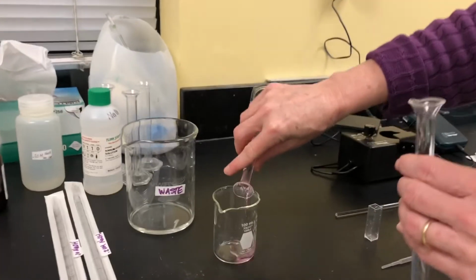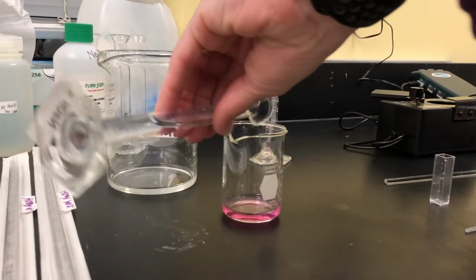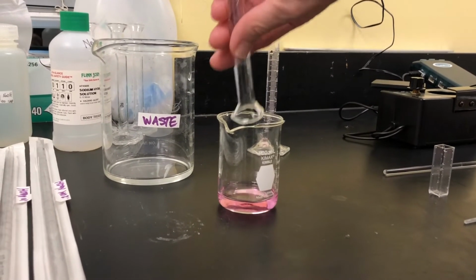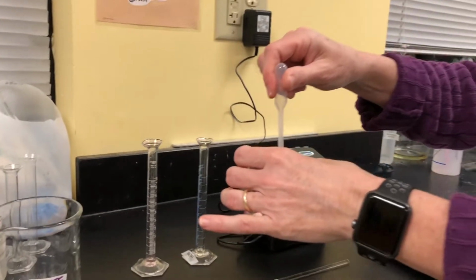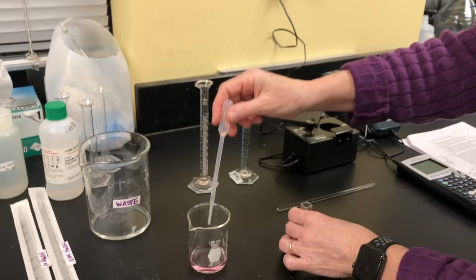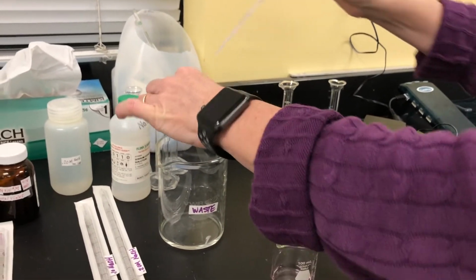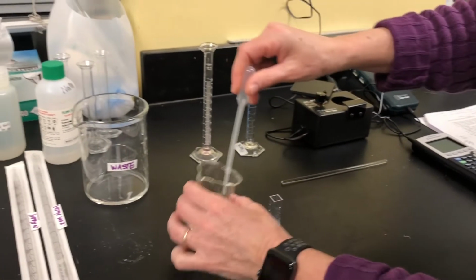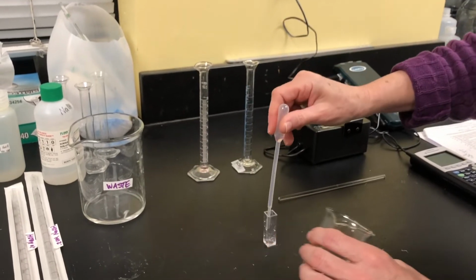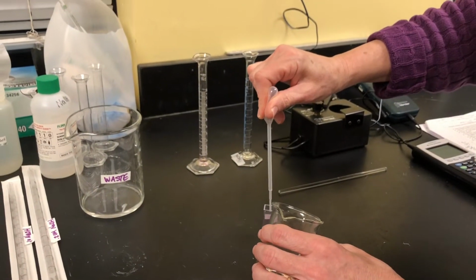I'm going to go ahead and pour my crystal violet in, and then I'm going to pour my sodium hydroxide in. And you can see right now it's still a purplish looking solution. Over time it will become clear, and that's what should happen. So right now I'm just conditioning it. I'm trying to squirt it on all the sides with the crystal violet solution just to make sure the cuvette is clear, is clean. All right, then now what I'm going to do is fill it about 3/4 of the way with our reaction mixture.